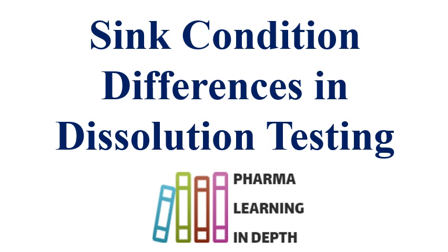For example, if you are working on a formulation with the strengths of 500 mg, 250 mg and 125 mg, you can find that the dissolution rate of the lowest strength, that is 125 mg, is faster compared to 250 mg and 500 mg. Or in other words, the 500 mg or higher strength has the slower drug release.